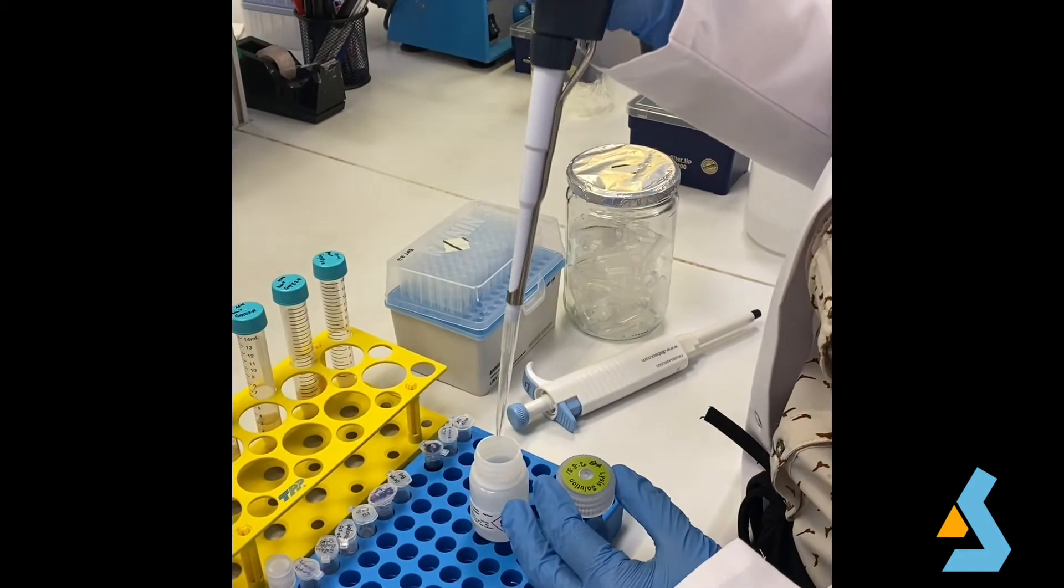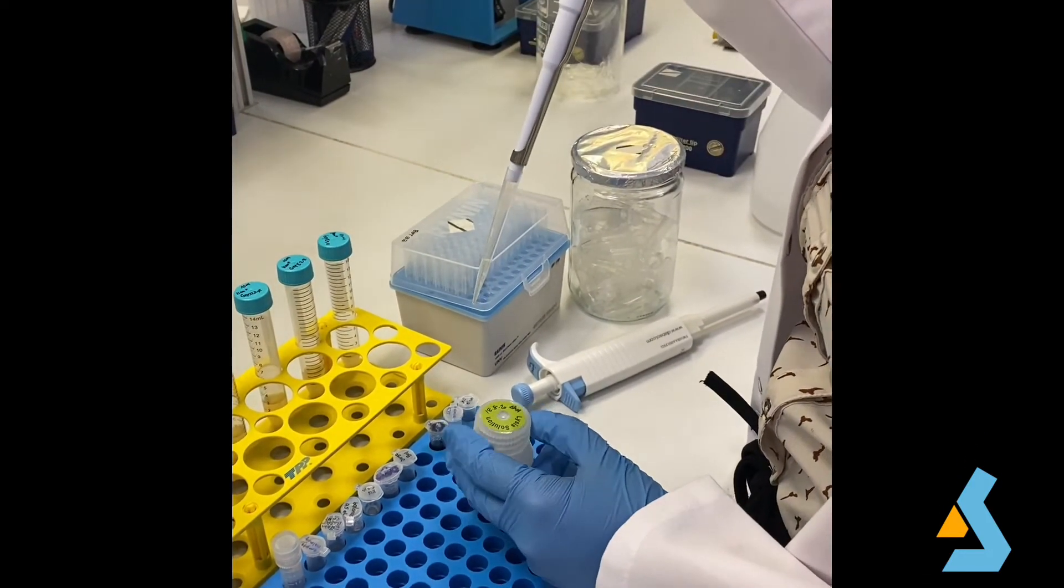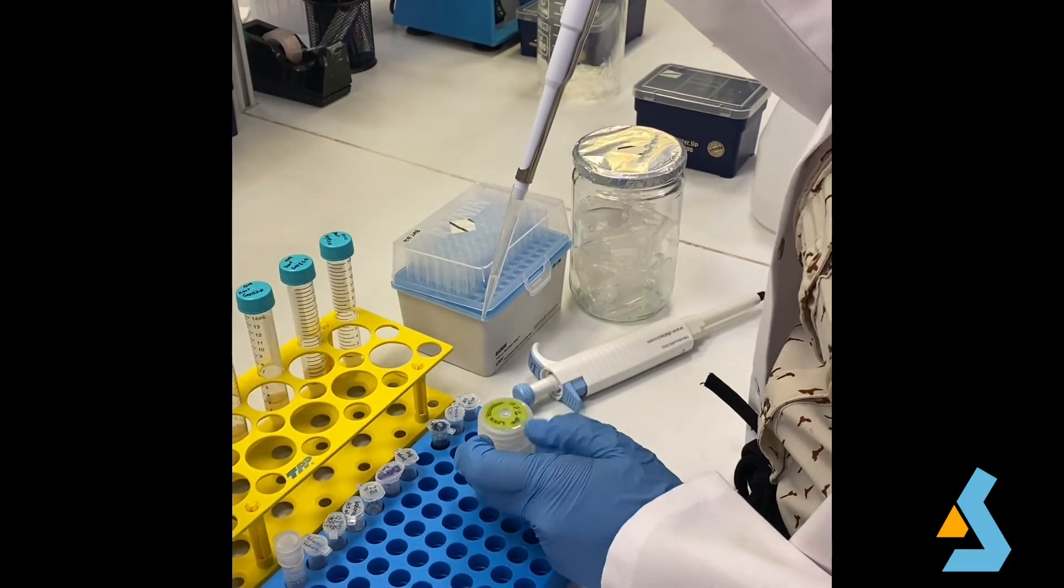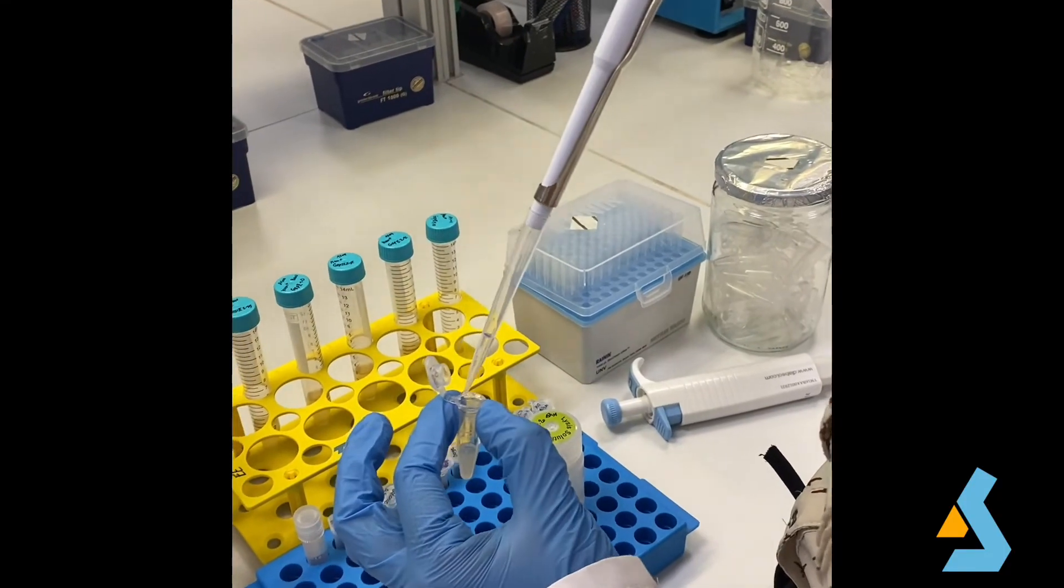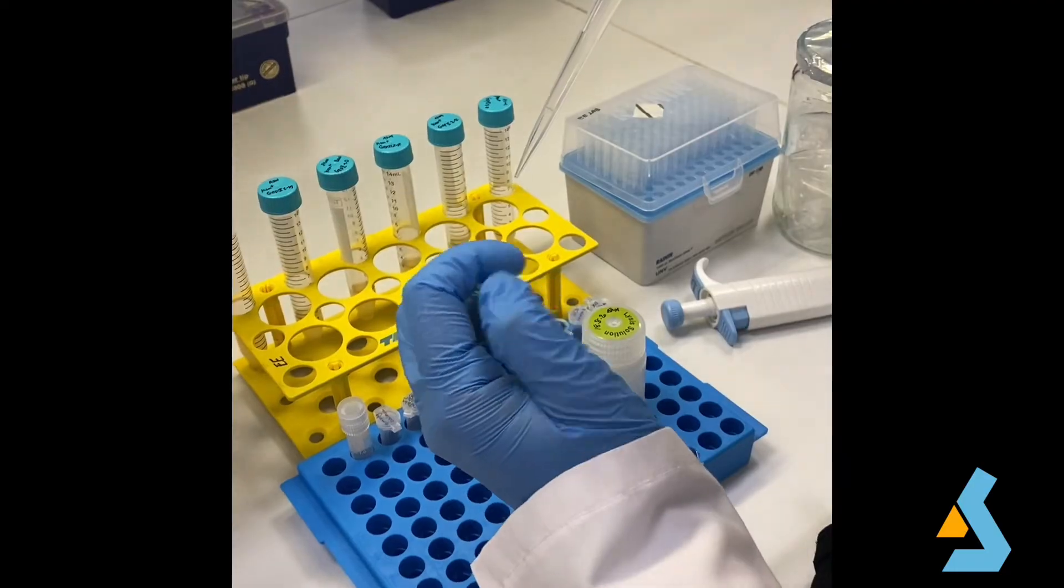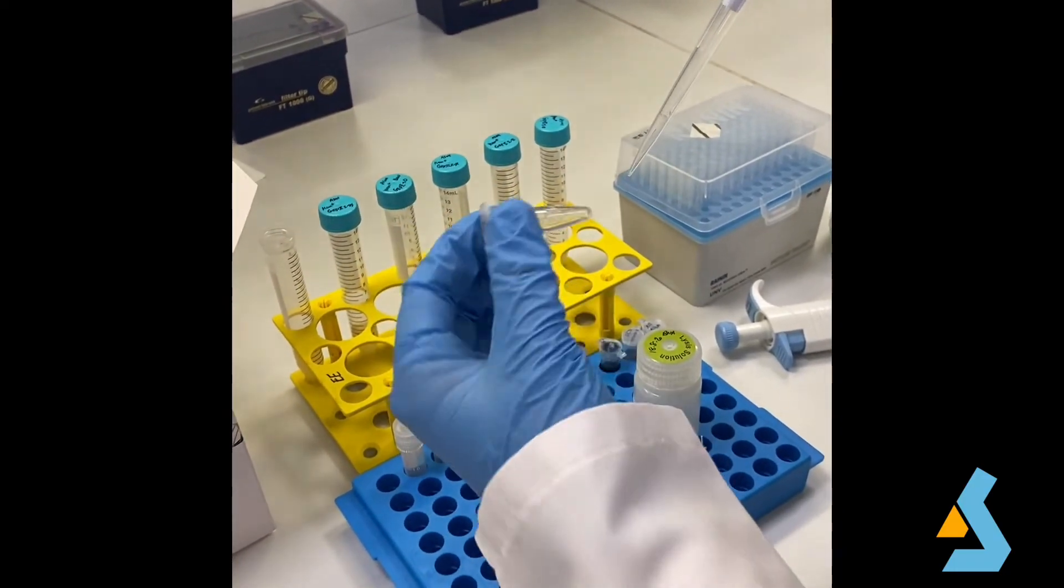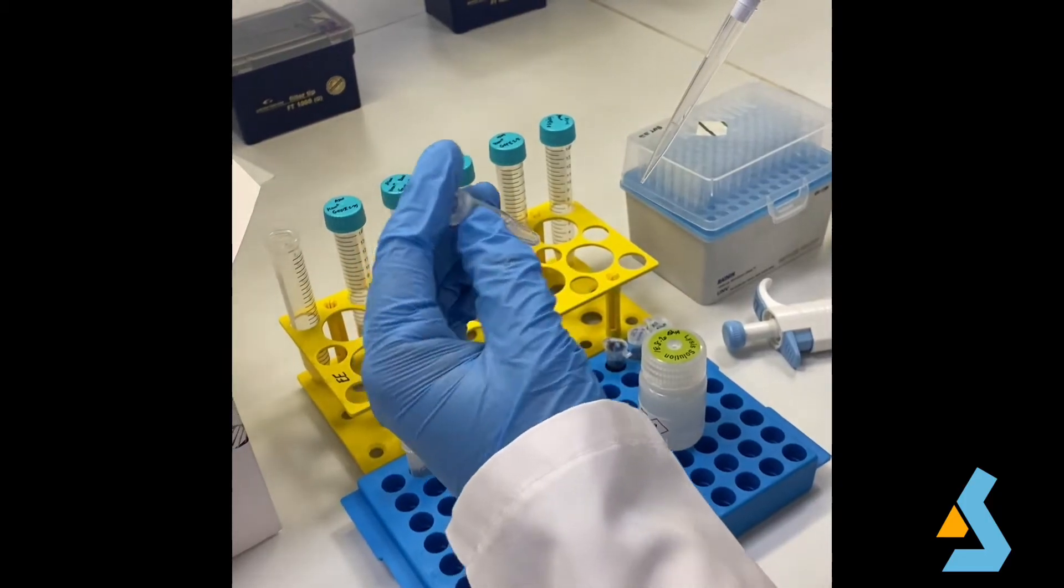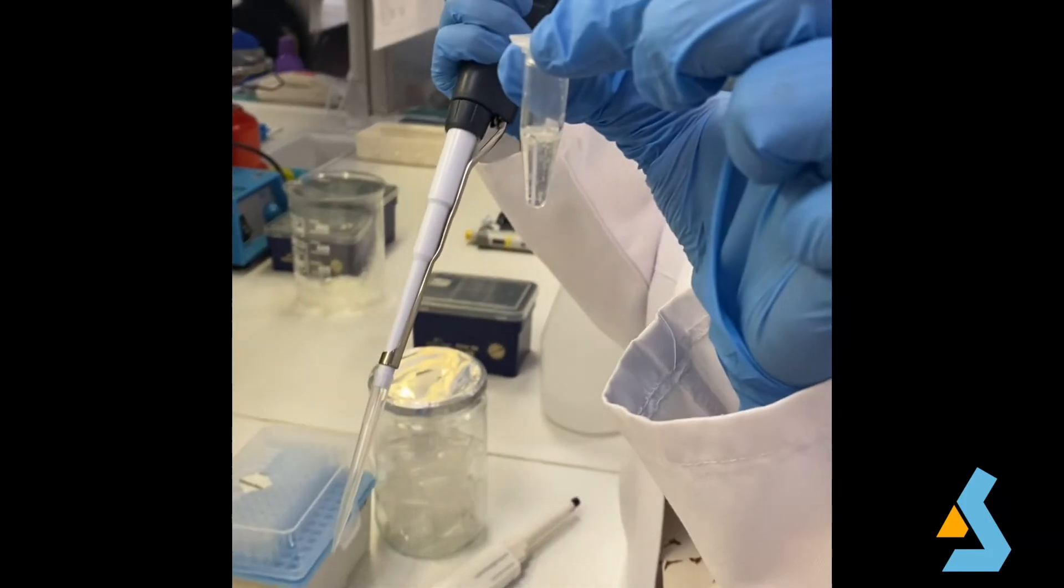Then cells are lysed in 250 microliters of lysis buffer. Lysis buffer contains a detergent such as SDS to break down the cellular membrane. In this step, DNA is released into the cell suspension. For this to happen, we need to mix thoroughly by inverting the tube four to six times until the solution becomes viscous and slightly clear. And we should keep the tube at room temperature for three minutes.